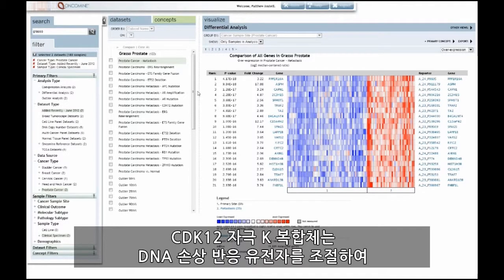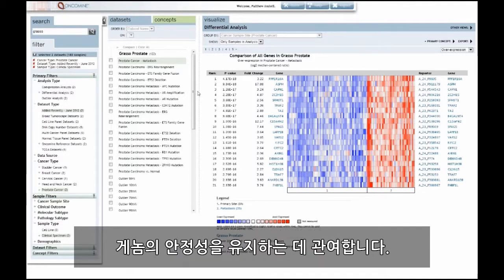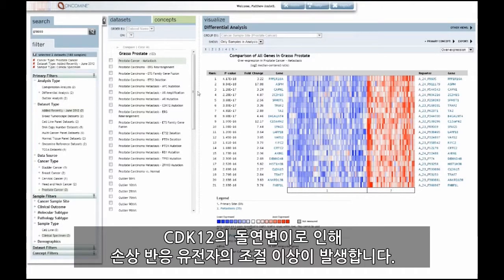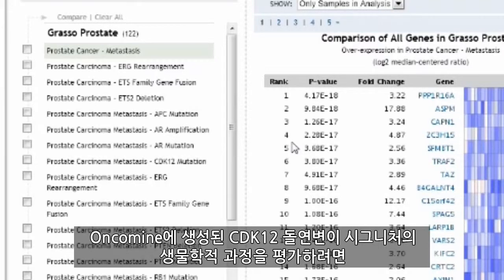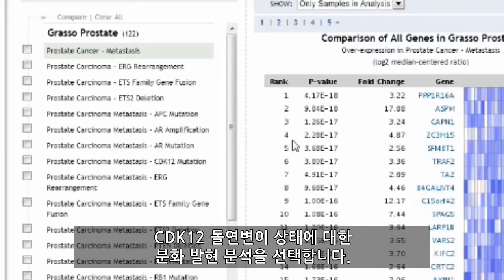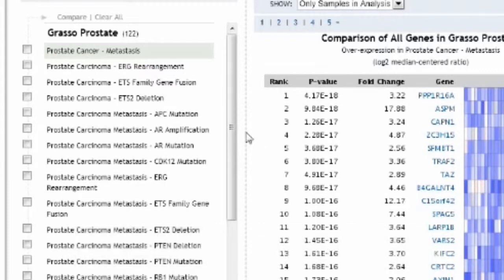The CDK12 and cyclin K complex is involved in maintaining genomic stability through the regulation of DNA damage response genes. Mutation in CDK12 results in deregulation of damage response genes. To evaluate the biology of CDK12 mutant signatures generated in Oncomine, we can begin by selecting the differential expression analysis for CDK12 mutation status.